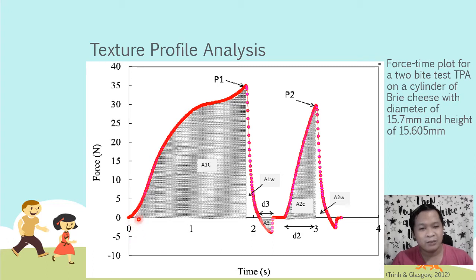So as a function of time, you can just see the amount of force needed to proceed with the test. Okay, so makikita mo dito yung peak, tapos yung release. Meron pang negative force. Negative meaning, kasi di ba pag positive yung force, ibig sabihin pushing downward. Pag negative, it's pulling up. Okay, so something like nagre-require ka ng effort para buksan yung bunganga mo. Kailan ba nangyayari yun? Pag may dumidikit na stringy cheese or something, di ba?